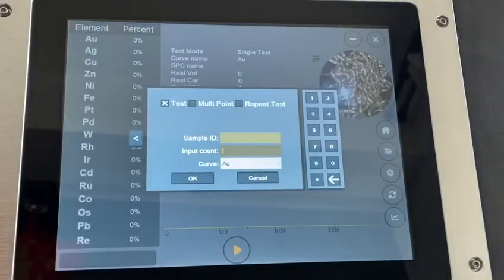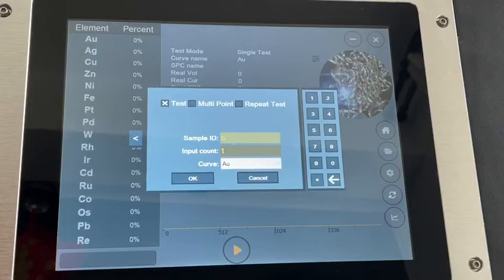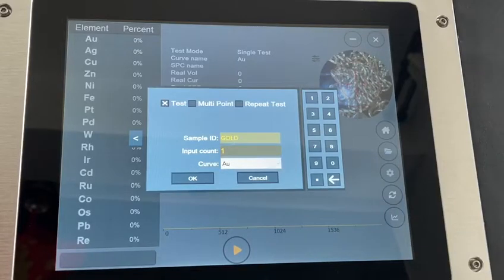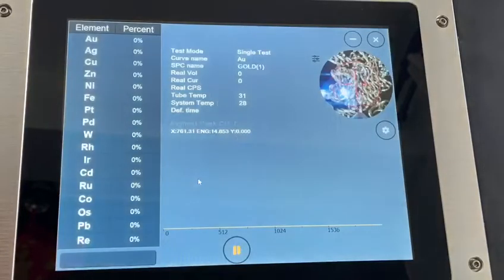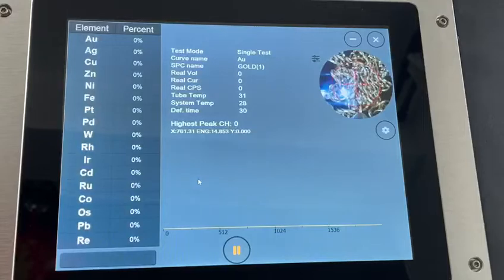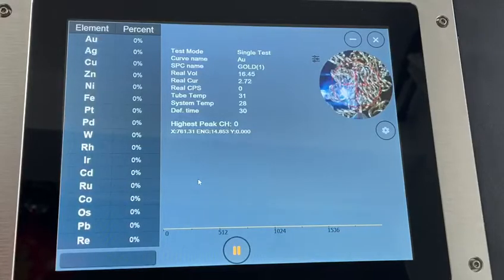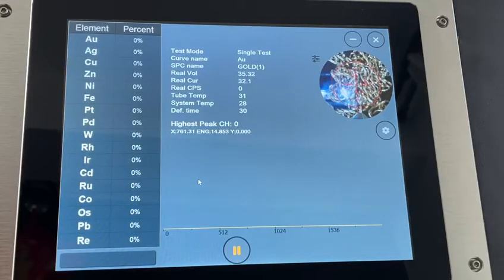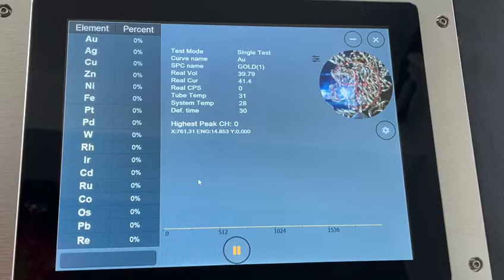Give it a name, let's say 'call'. Press OK. This time is set for 30 seconds, so you have to wait for 30 seconds.